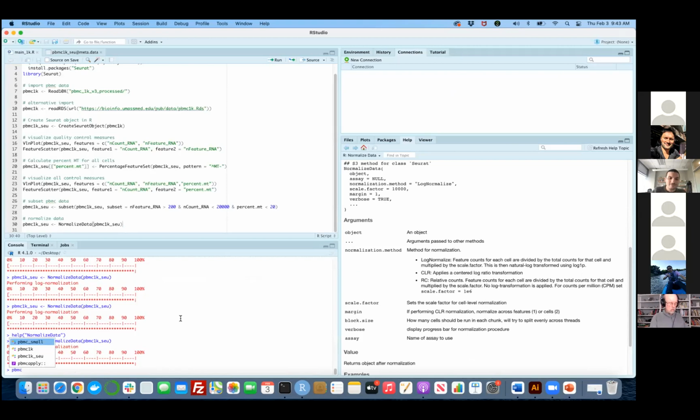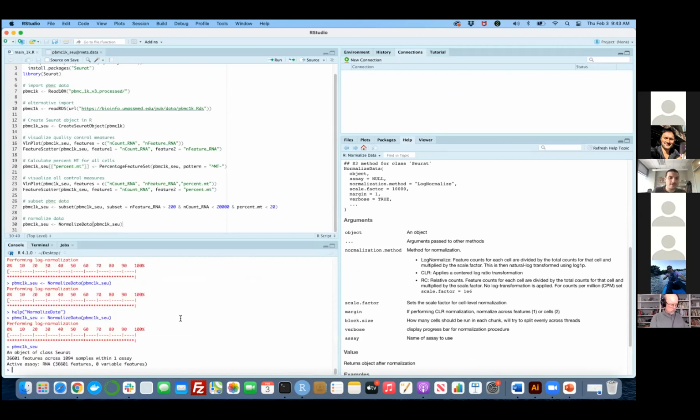You may take a look at the expression of some genes, but you will have to take a look at each cell, which could be some number of thousands. So we have to have a much more elegant way to understand what kinds of different cells we have in our data set, right?